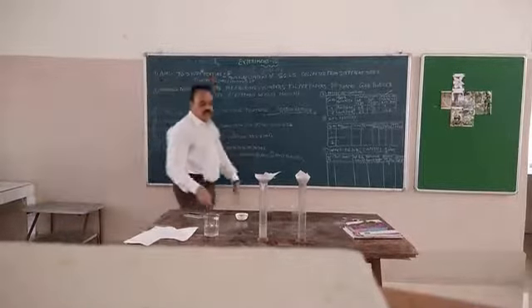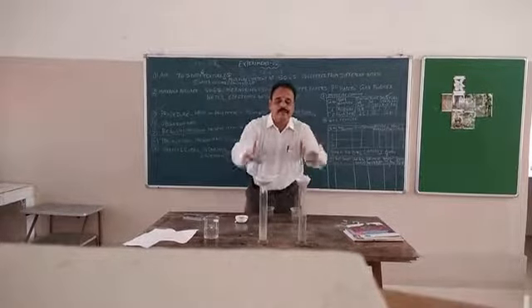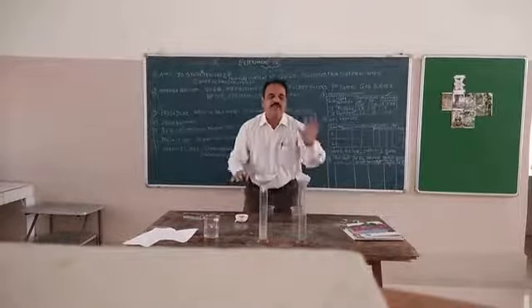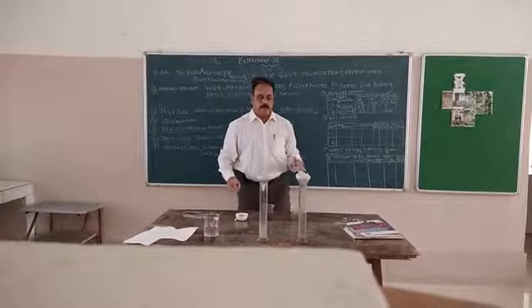Then we go to the third one, water holding capacity. Now for that, what do we do? First, we take equal weight. Like I have taken 50 grams: 50 grams roadside soil, 50 grams garden soil. Of course, we have measured with the help of the weighing machine.